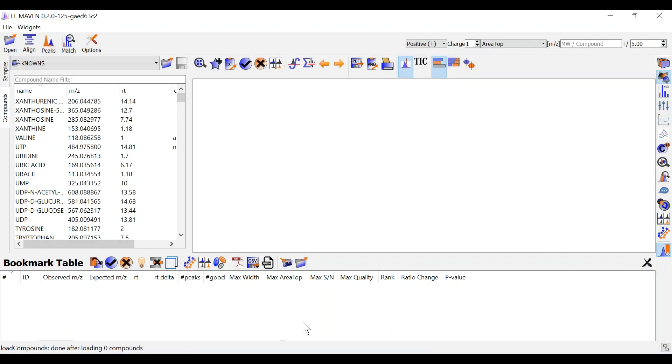For this you must have your files in mzxml or .mzml formats. If you do not have so you can use msconvert to convert your files to the desired format.